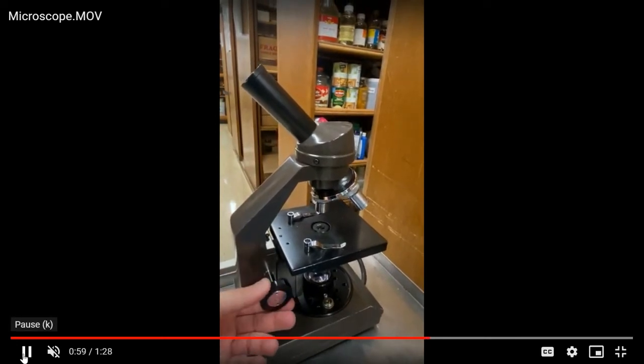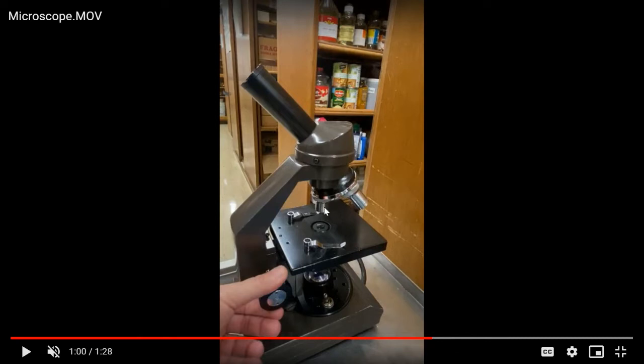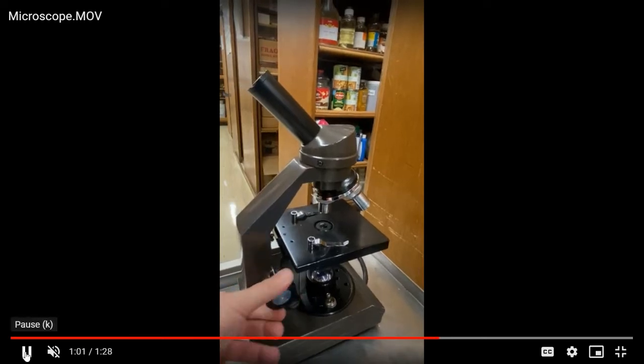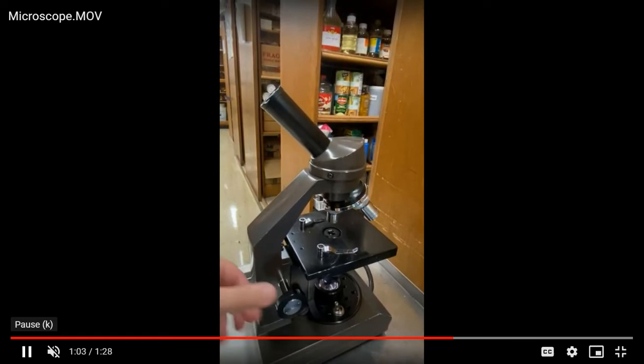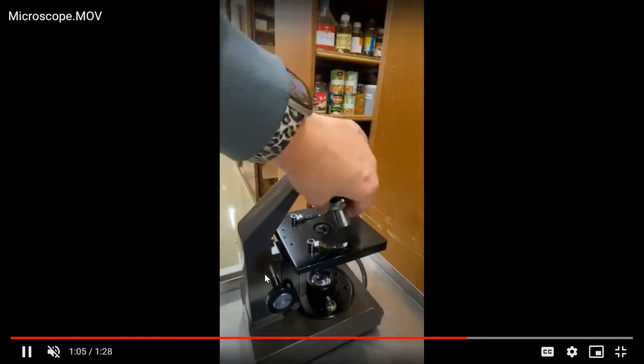You are always going to start off trying to find something in the microscope under low power. Low power is the shortest one here. It has a magnification of 4x. You'll use the course adjustment in order to bring the stage up and down to get things into view.